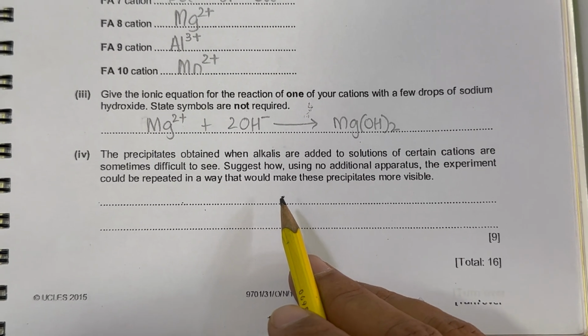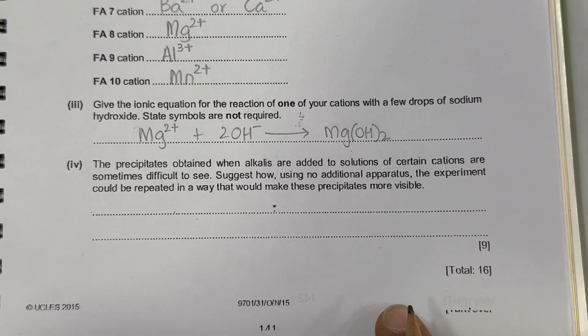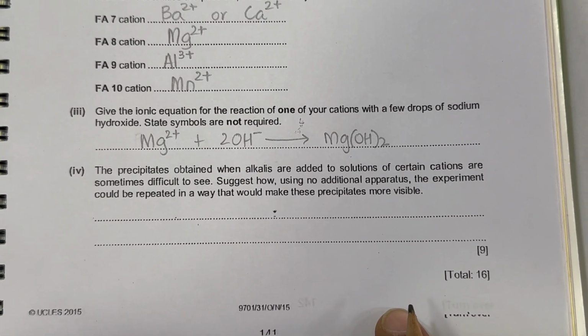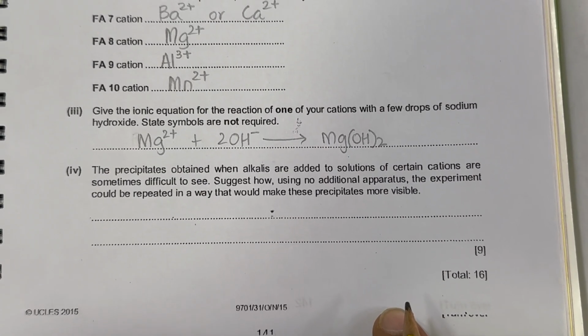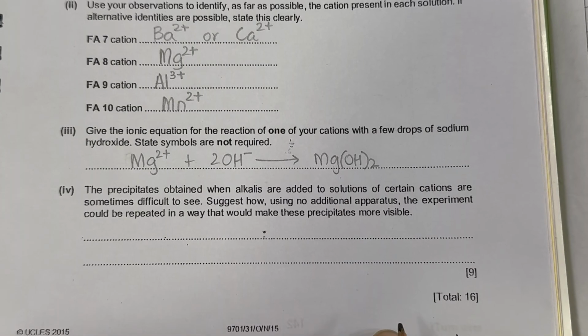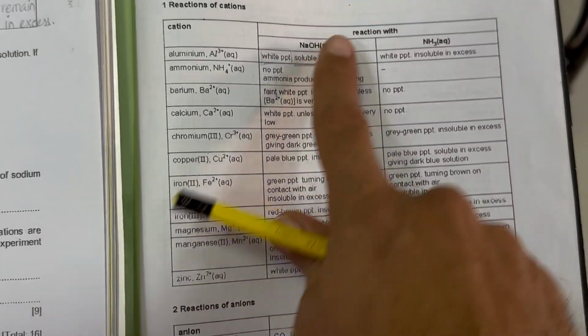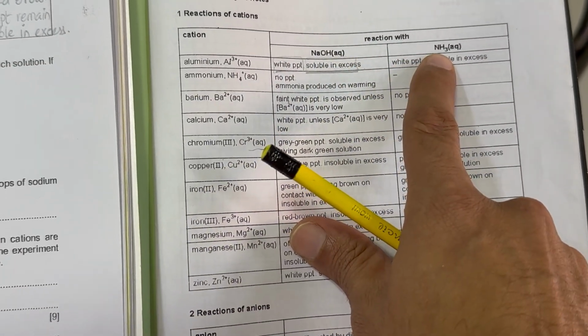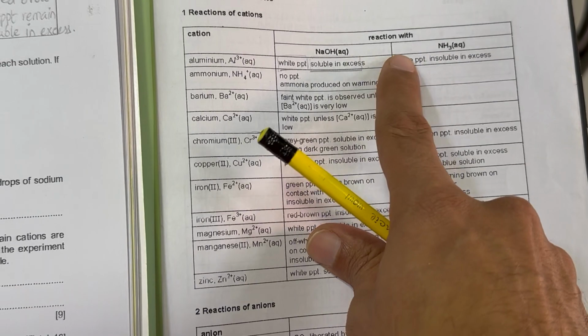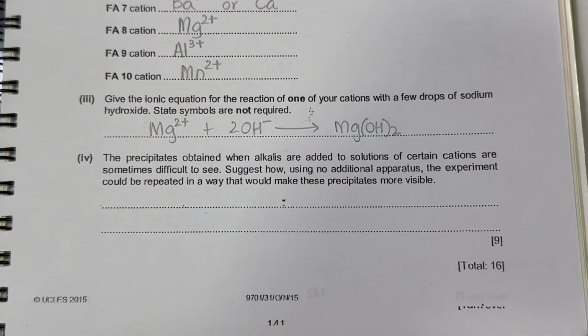So sometimes if we are not getting a precipitate, it means we are adding a chemical that has a very low concentration. So in order to obtain better results, we can increase the concentration of our chemicals like sodium hydroxide and aqueous ammonia for the test of cations where we add these two chemicals. We can increase the concentration of these two so that the results will be more evident and more profound.